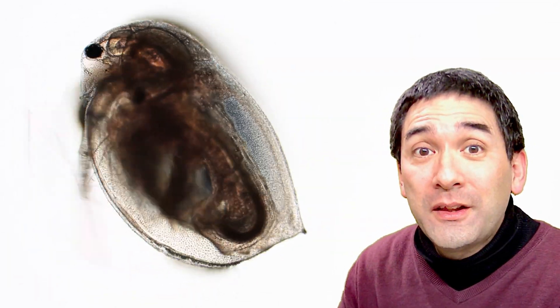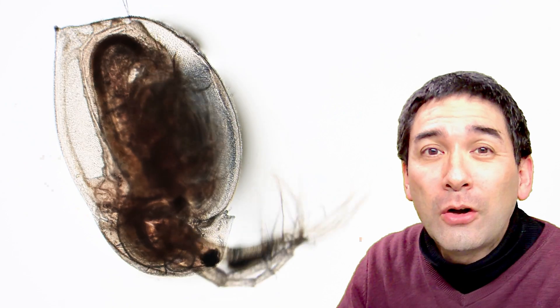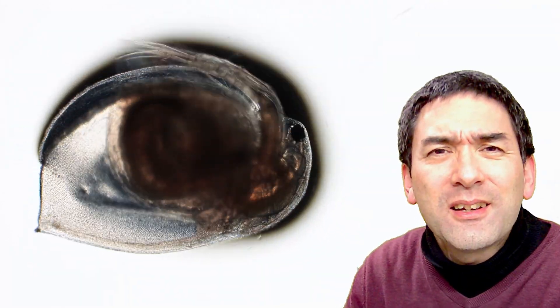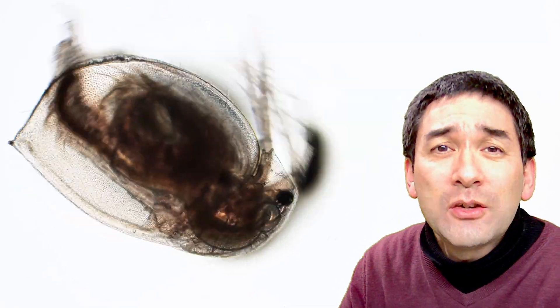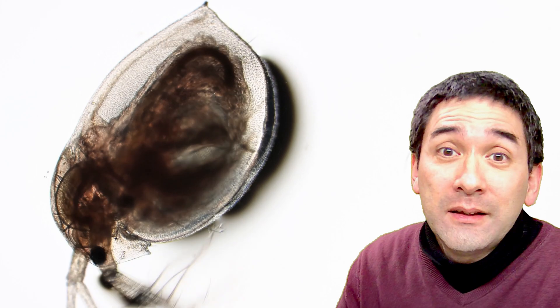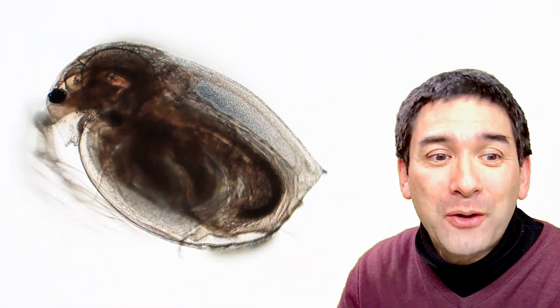So first of all, these little Daphnia are basically tiny, probably maybe two or three millimeters large. They're not insects, they are crustaceans, and this means they're related to the crabs and to the shrimp, and they can be bought as fish food, which is basically where I got them from.